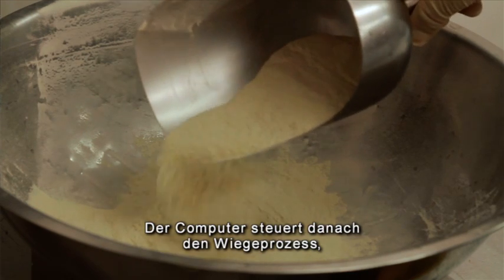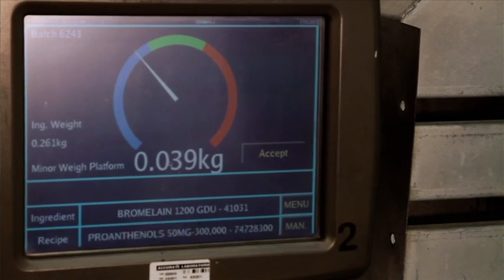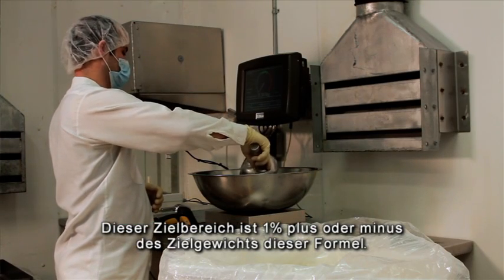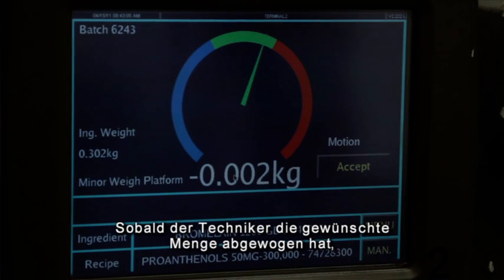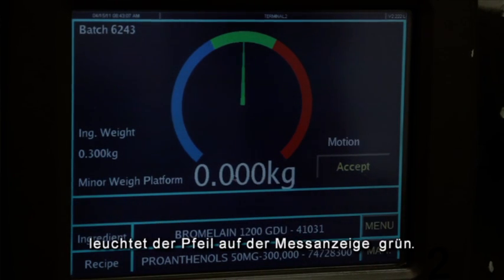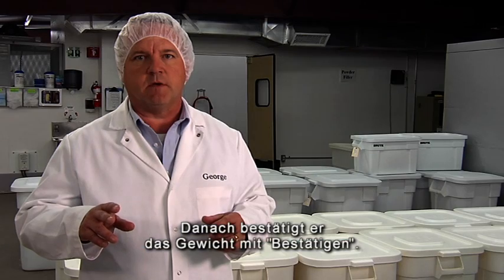The computer will then allow him to begin weighing using a dial gauge that shows a green zone, which is his target zone. This target zone is plus or minus one percent of the target weight for that formula. Once the operator has weighed the proper amount, the indicator will turn green on the dial gauge and he will be able to hit the accept button and accept his weight.